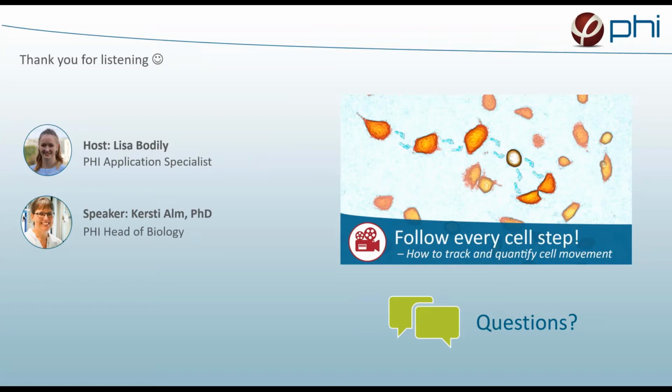Martin from Vienna is asking, can I track any type of cell? Well, the HoloMonitor is made to work with adherent monolayer cells, but anything from cancer cell lines to primary stem cells work. If you have questions regarding a specific cell type, please contact us.